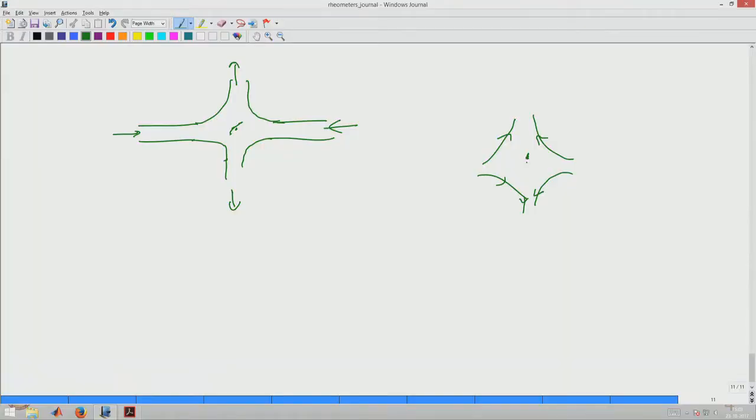So, basically what we are asking is, if I let us say take the material, form an interface, right. So, if I take the fluid in a beaker let us say and then form the interface. So, in here if I measure, then this is a bulk viscosity or bulk G prime, but instead I want to know what is the G prime here, right.